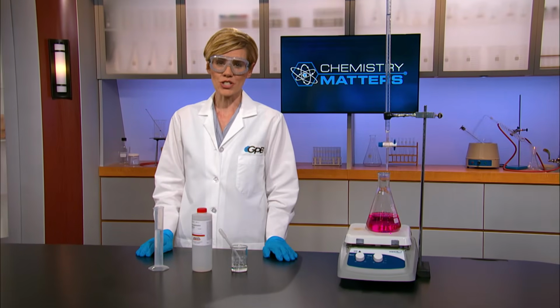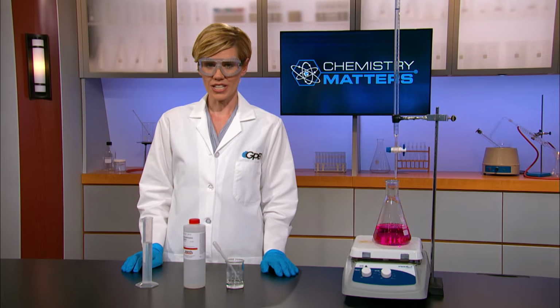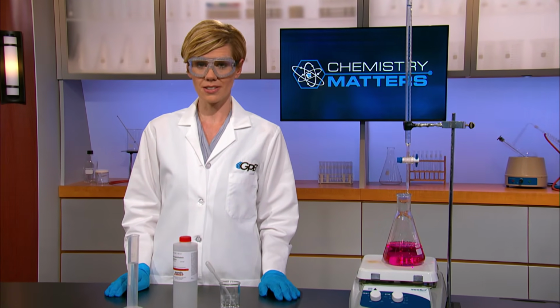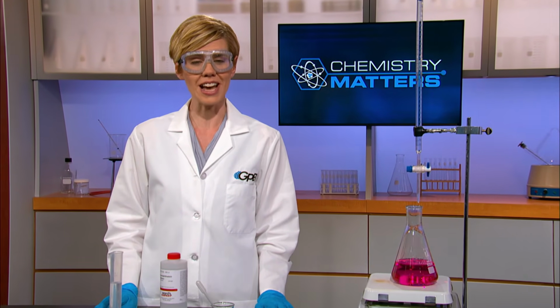While our students get started on their titration labs, we'll let you do the same thing. Work with your teacher to make sure you're following good lab practices and safety procedures, and carefully log your results so you're able to argue from evidence when analyzing your data.